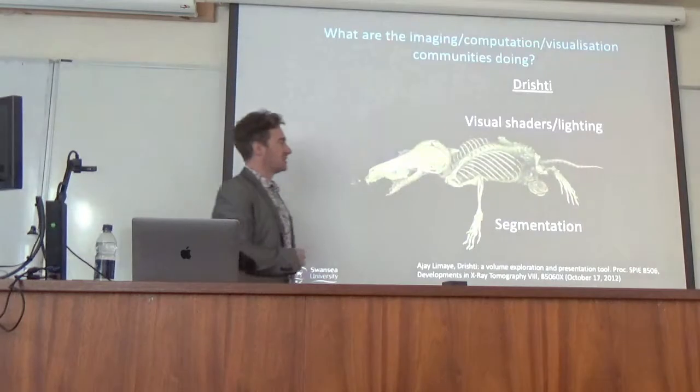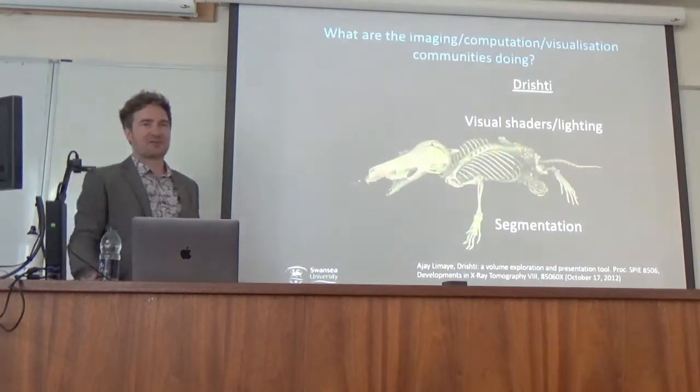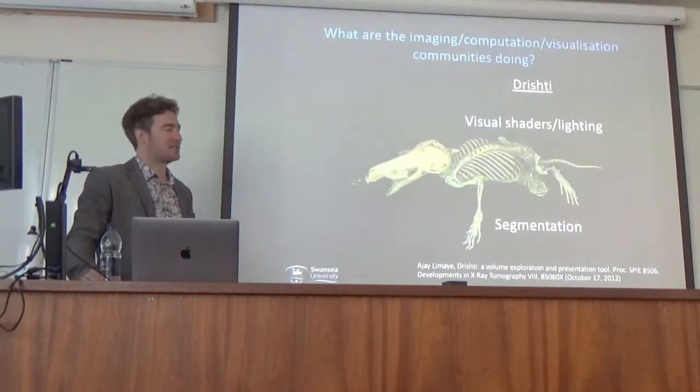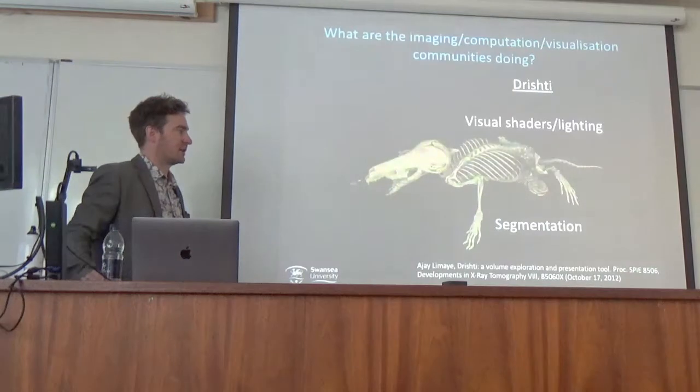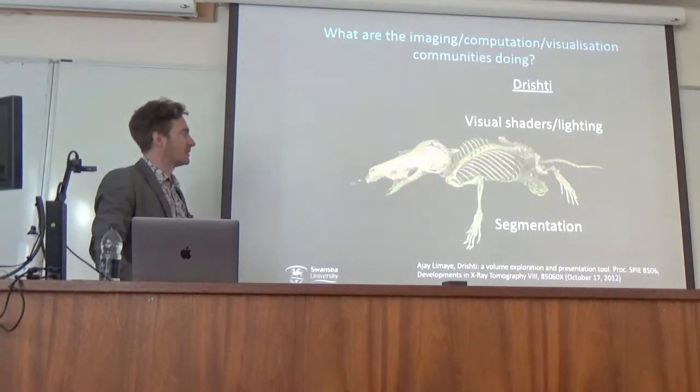It can do segmentation, and some people in the group will go to that. Everyone goes to different software, really. Some will go to Drishti to segment. I can't go near it for segmentation. It's challenging. It's tricky. You have to spend time, but yeah, I've not been using it.